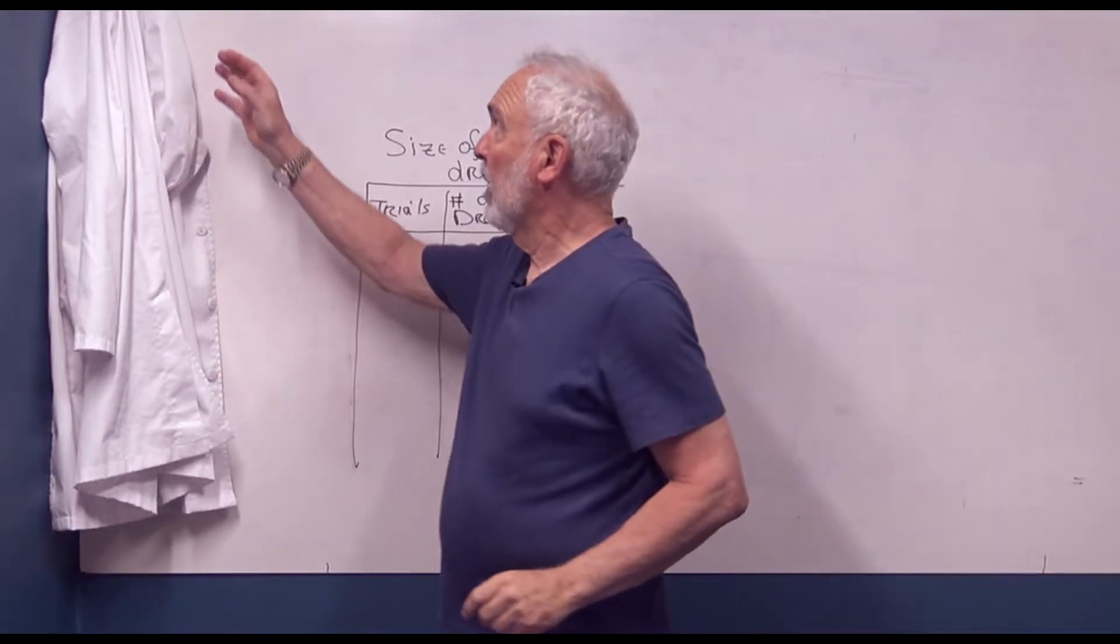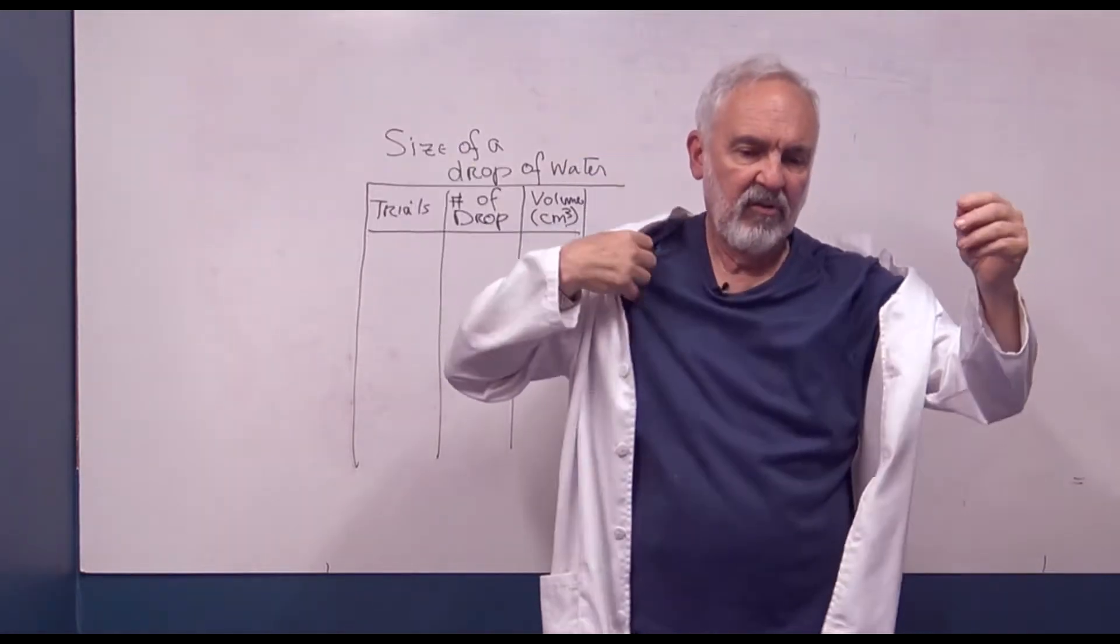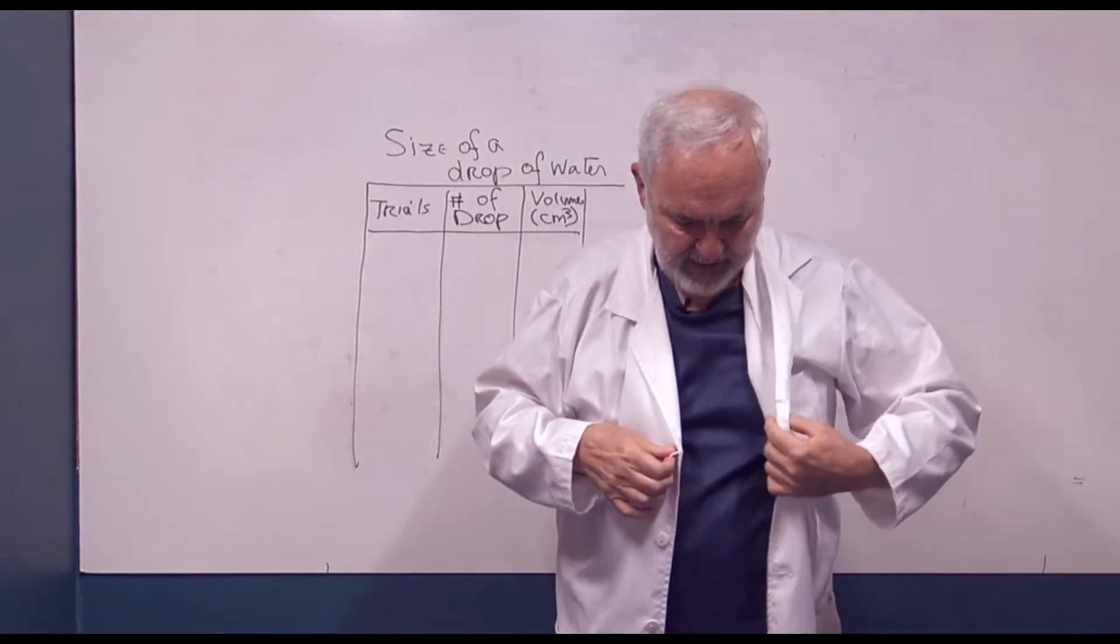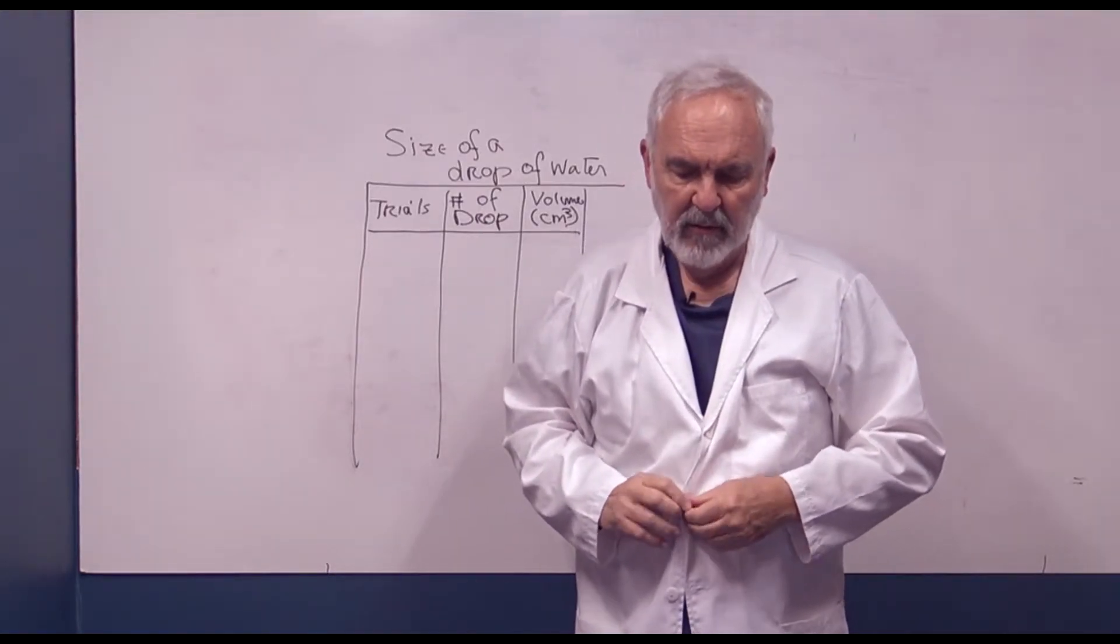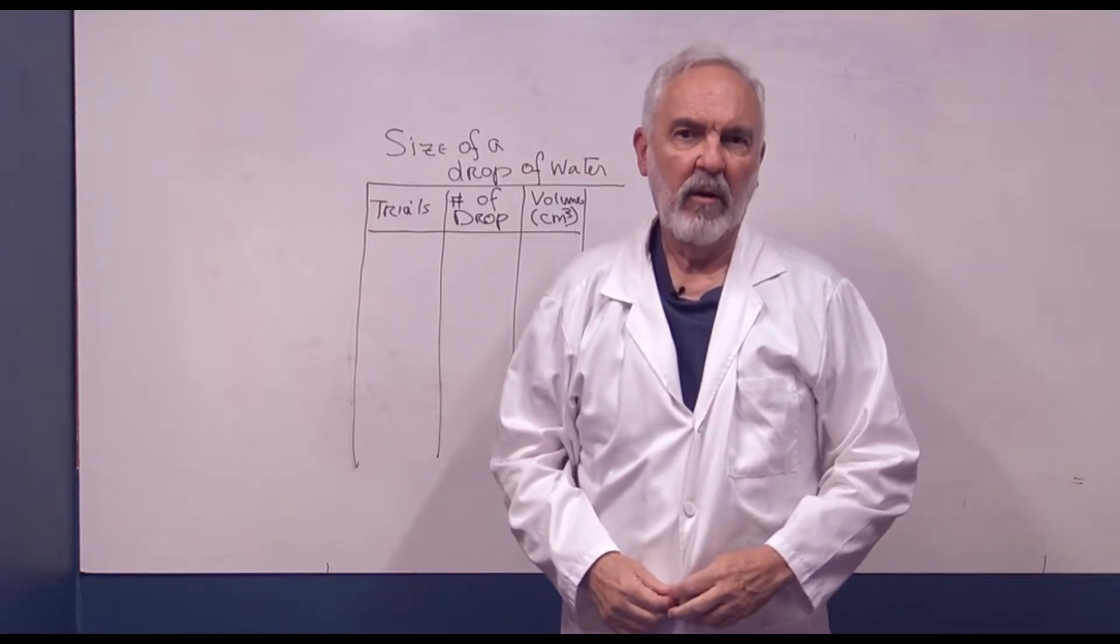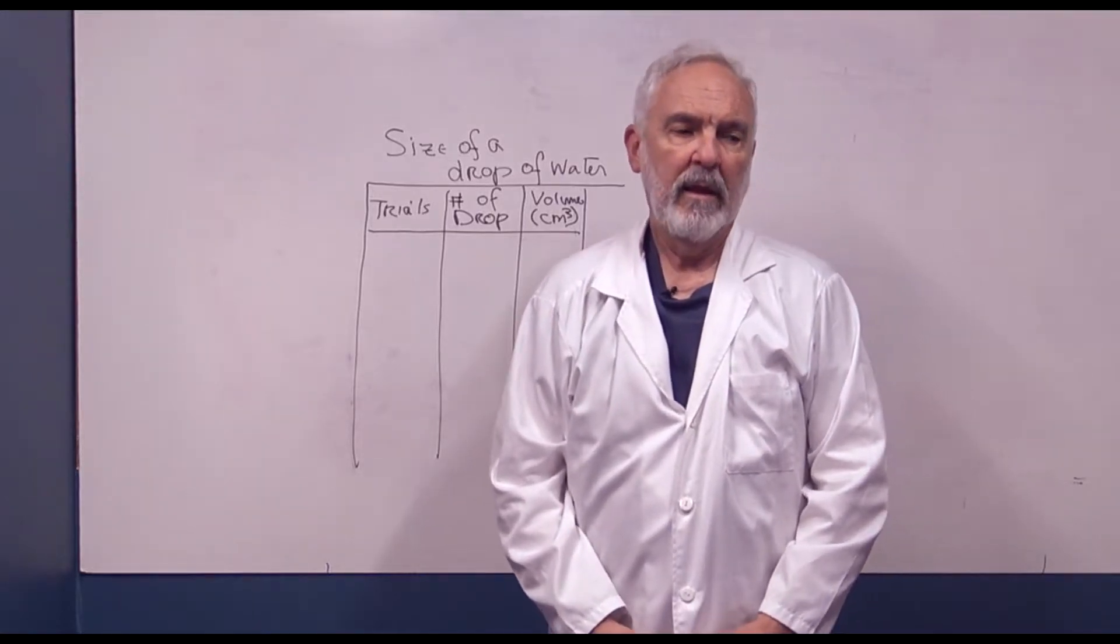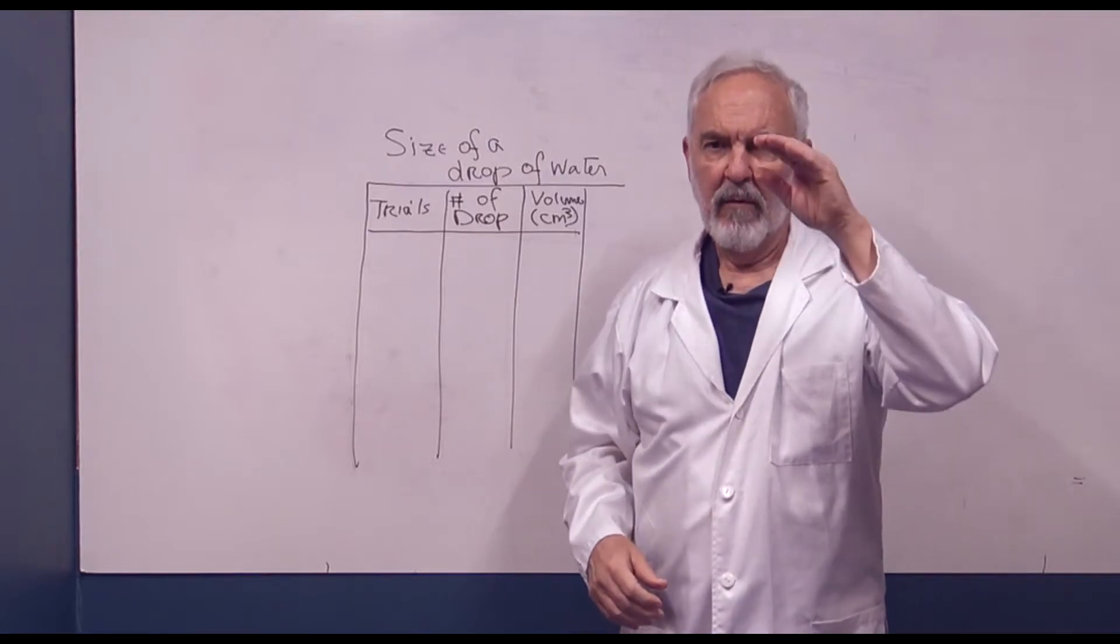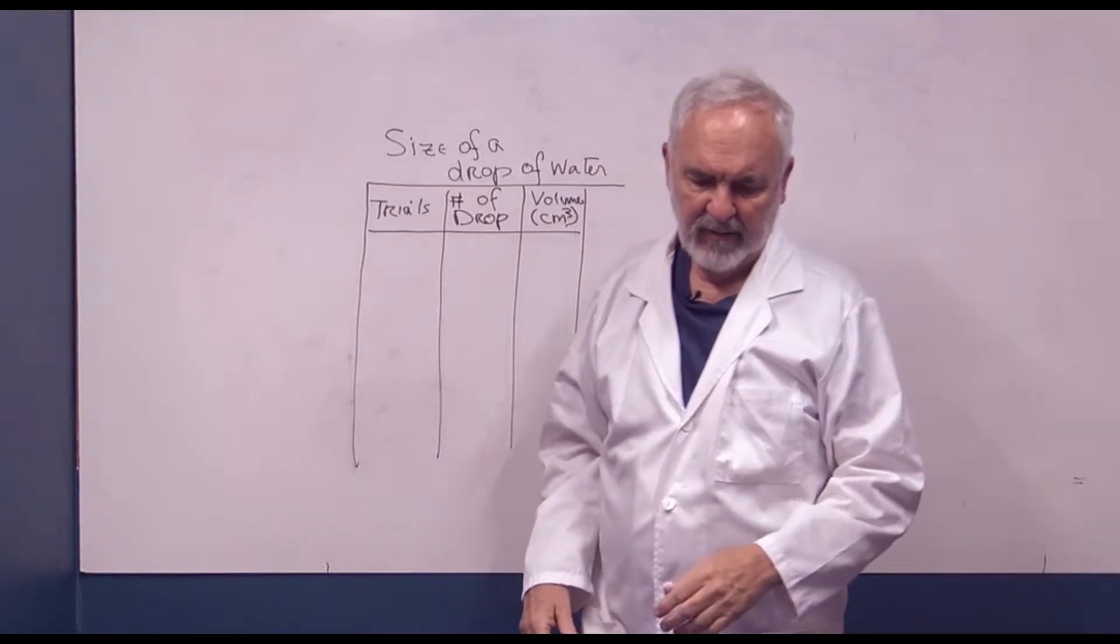We'll also put on a lab coat. Water is not particularly dangerous, but it's a good habit in case I spill some. This particular batch of water I have colored to make it a little bit easier to see through this graduated cylinder. I have another trick you'll see also for making it easier to read. I need all the advantages I can find to measure the fraction in between each line and divide it mentally into tenths.